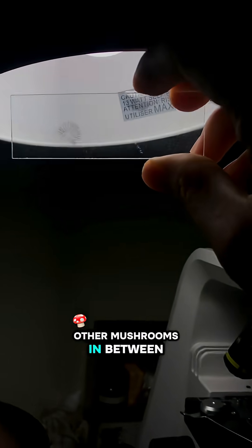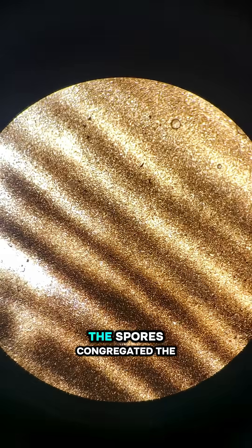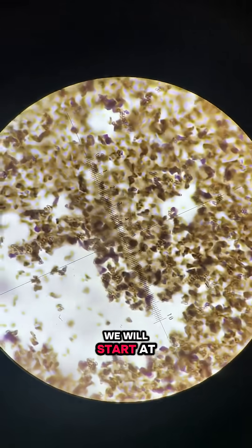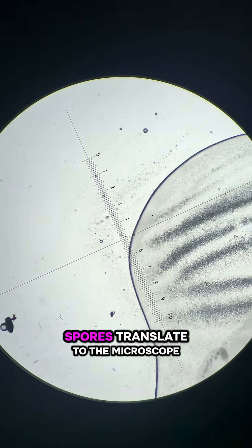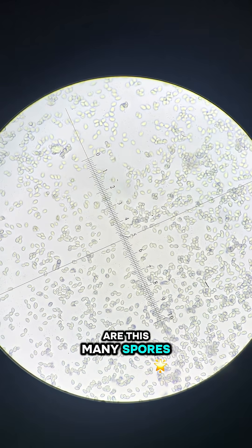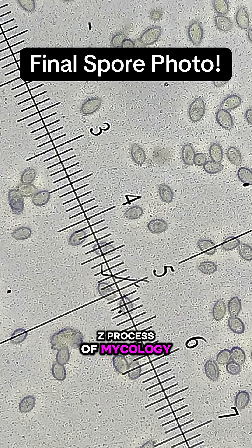I also found some other mushrooms in between, which I'll cover in another video. Let's dive into the microscopy. You can see where the spores congregated the most and the pattern of the gills. For each of these, we will start at 40 times magnification and make our way to 400 times. You can see the dark color of the spores translate to the microscope, which isn't always the case. I love when there are this many spores — makes my job that much easier. Follow to see more of the A to Z process of mycology.